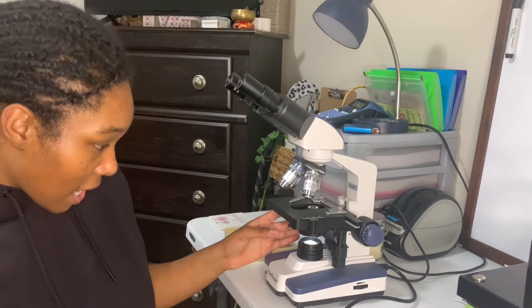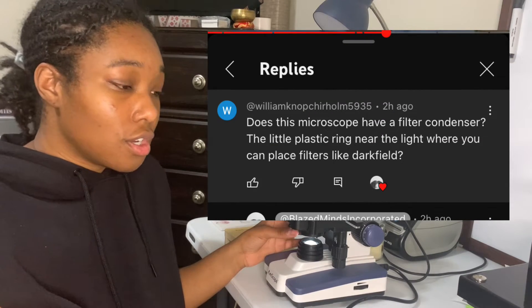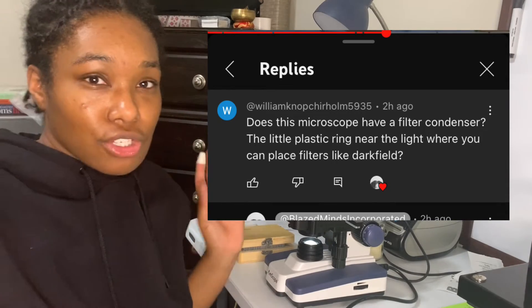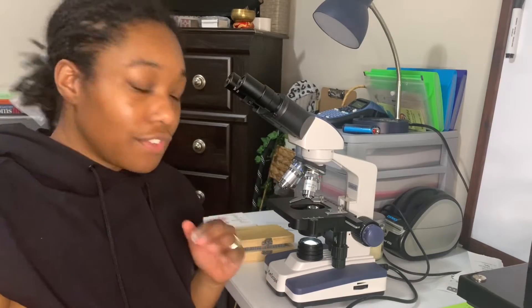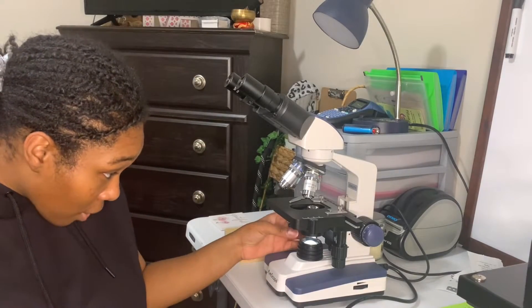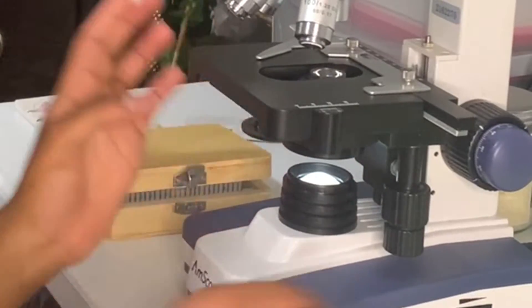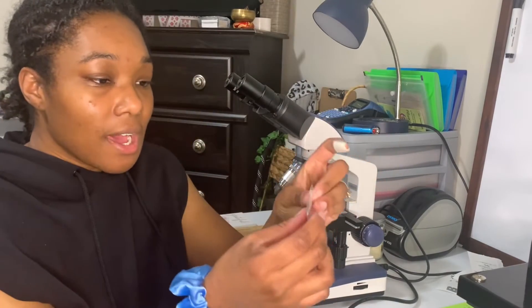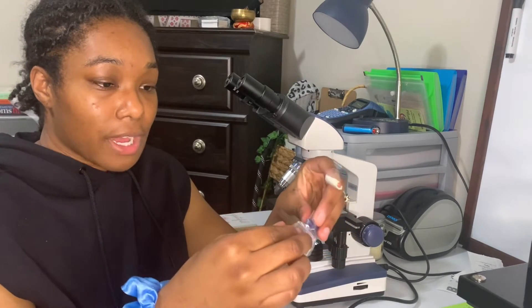There was a guy that asked me a question: does this microscope have a filter condenser, like can you place filters like dark field? And it does! That part is literally right here, and it comes with the microscope. So when you get your microscope, you'll get this and you're like, 'Oh my God, what is that?' — because that's what I did. But it is for dark field microscopy.